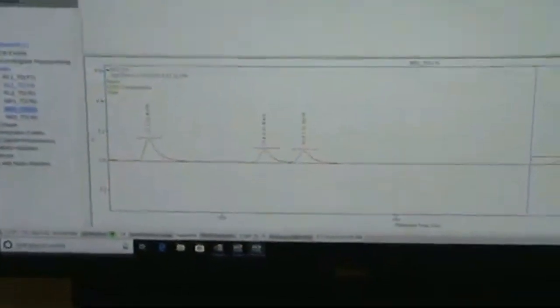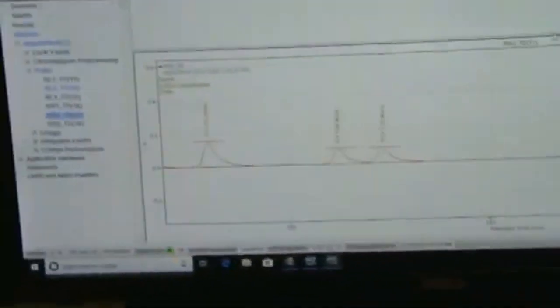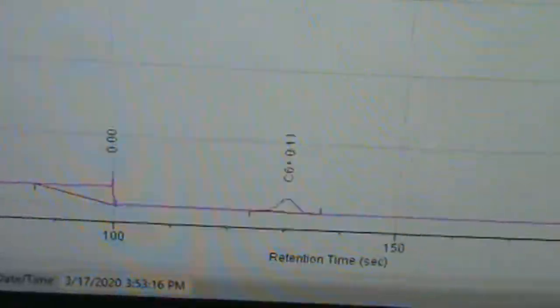Oh, everybody's good, everybody's happy, life is good. I see C5, I don't like that window being like that, so we're going to make you a 12. Analyze. Good. Let's see our back flush. Back flush in C6, that is a group. Let's see our group definition.